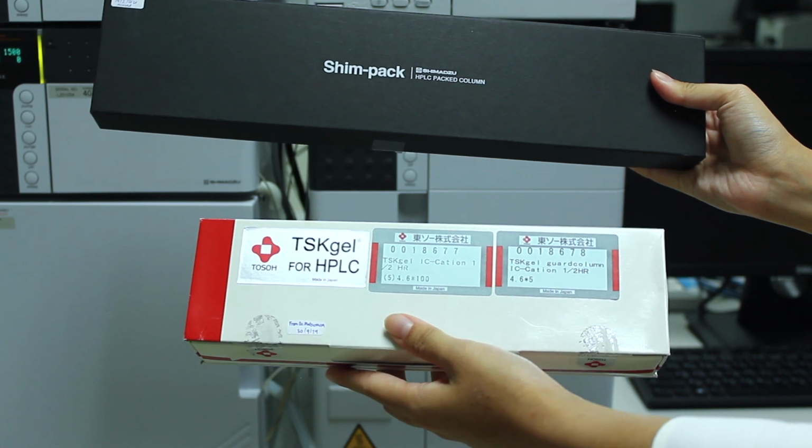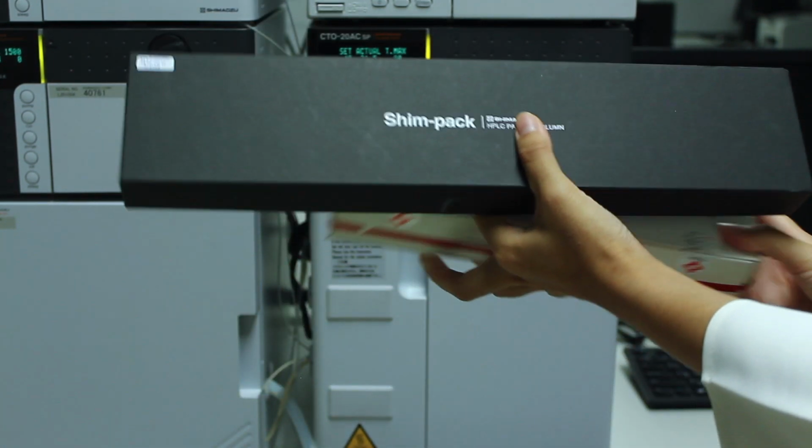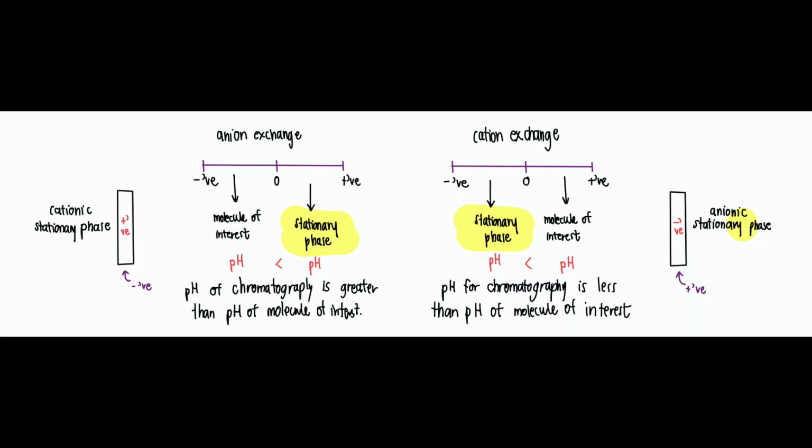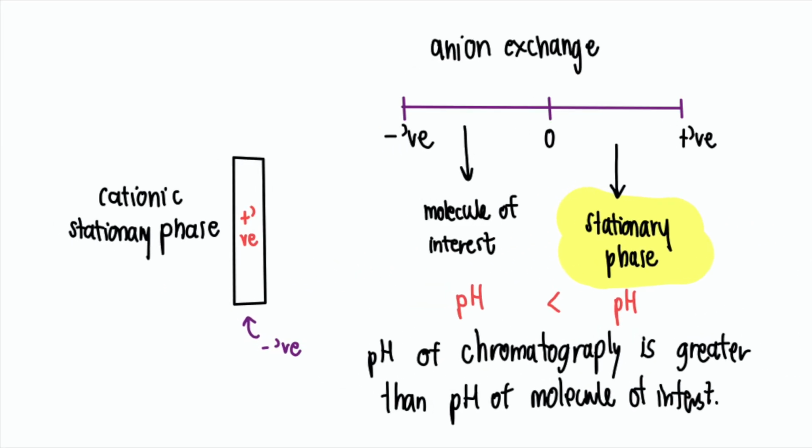There are two types of the exchangers or the column. One is anion and another one is cation. For the anion exchange, it has cationic stationary phase. It will be used when the molecule of interest is negatively charged. So the pH of chromatography is always greater than the pH of the molecule of interest.